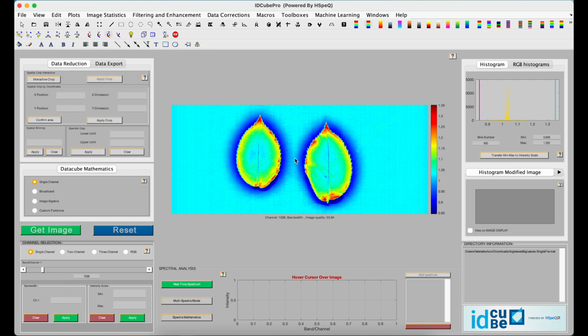A valid region of interest has characteristics such as topographically flat, spectrally flat or uniform spectral response, and shows a strong signal source to reduce the impact of random noise.